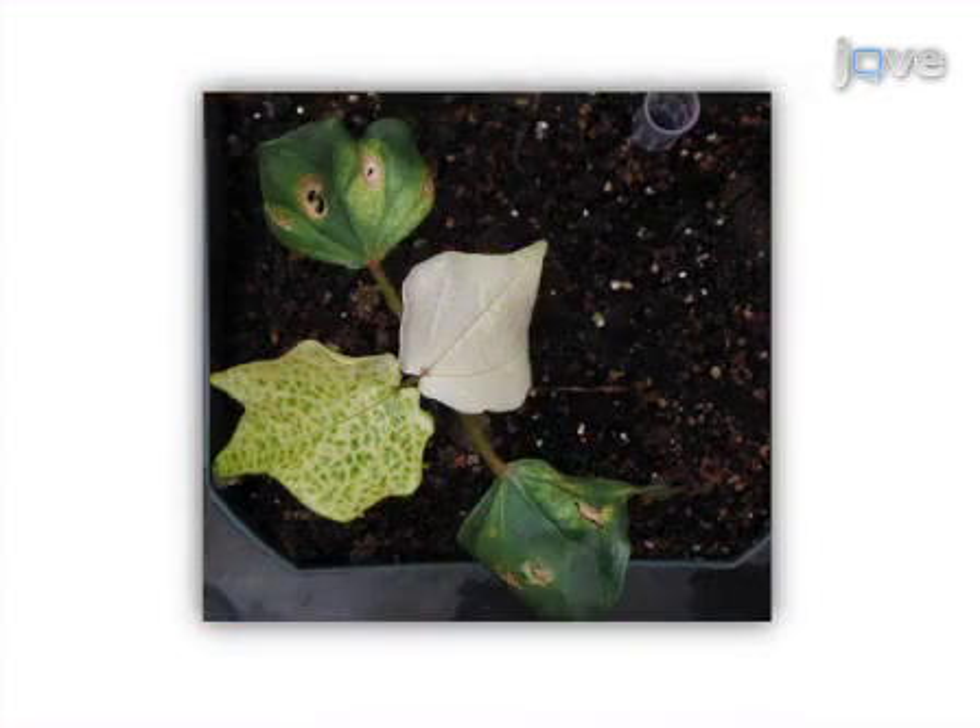Ultimately, results can be shown for gene silencing by observing the albino phenotype on the true leaves of cotton plants about 2 weeks later.